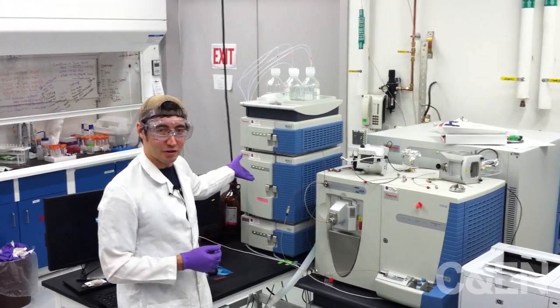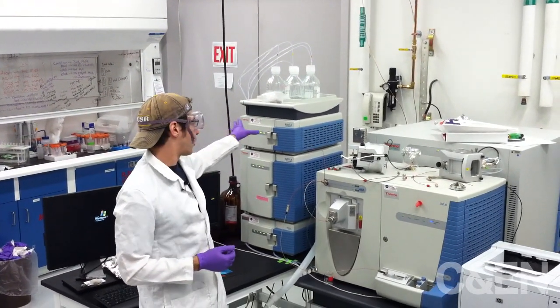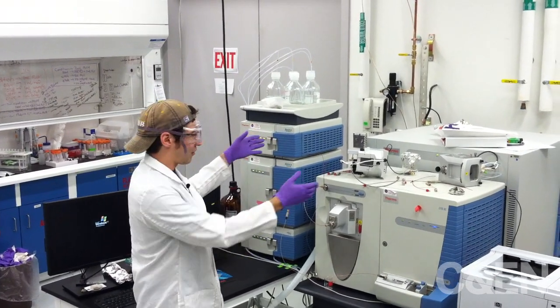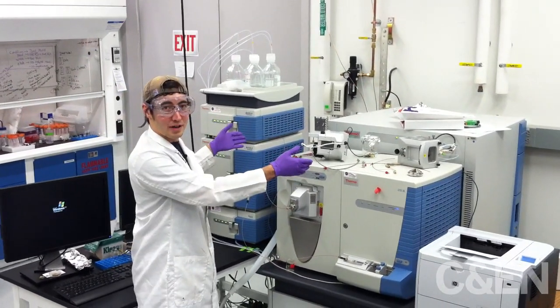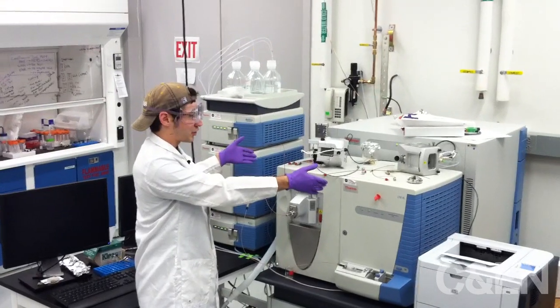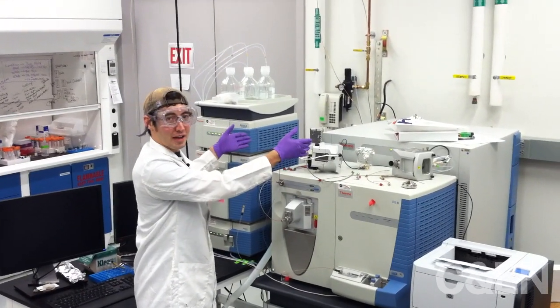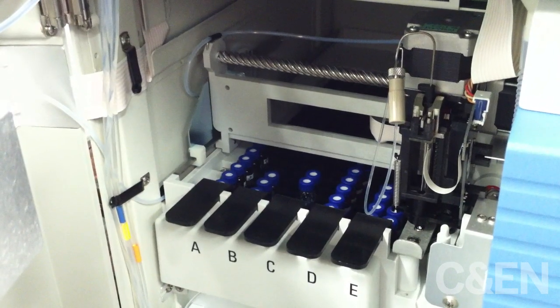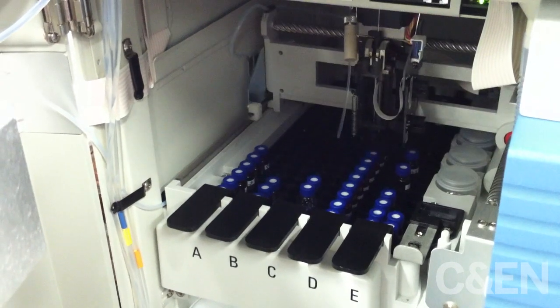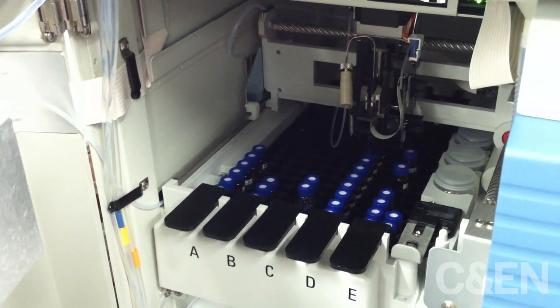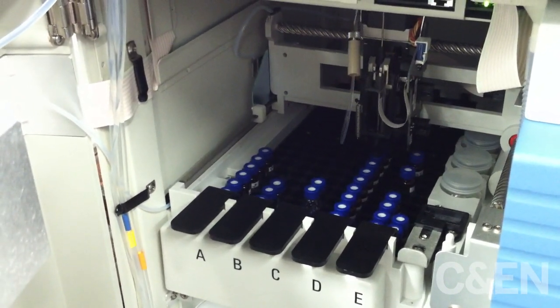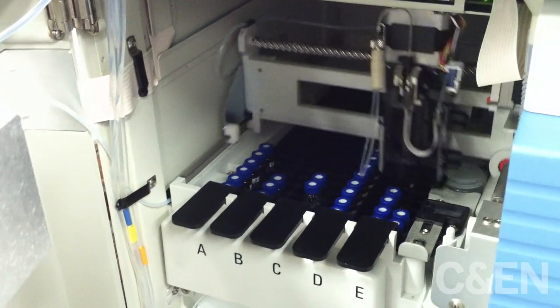This is a high performance liquid chromatograph which has a photodiode array detector, and that's also coupled to a tandem mass spectrometer. This is an ion trap coupled to an orbitrap mass spectrometer, which gives us really high mass resolution and high mass accuracy to help us identify our compounds. We'll basically do an injection on this instrument.